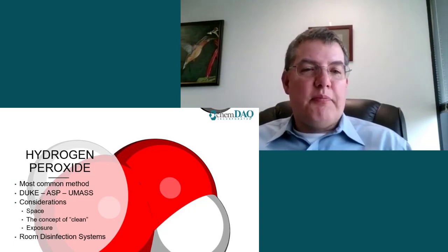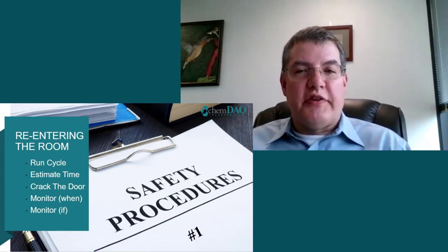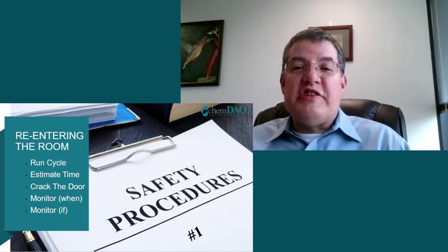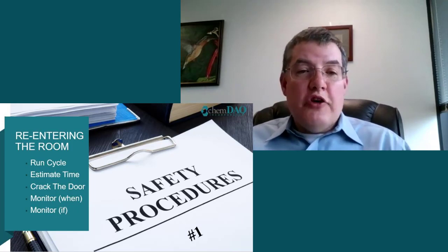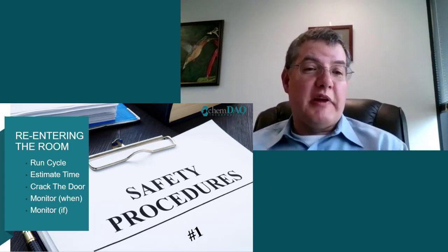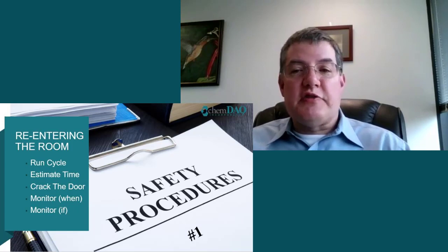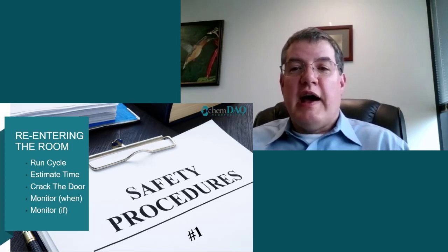With room disinfection, the big question is, how do people know when it is safe to go back into the room after the disinfection process is over? Hydrogen peroxide is colorless and has essentially no odor, and so smell cannot be used as an indicator of concentration. The OSHA permissible exposure limit is 1 ppm, so a very low concentration, as may be expected for something which is a commonly used sterilant gas. If operators do not wait long enough before re-entering, they risk being exposed to dangerous concentrations of hydrogen peroxide. And if they wait too long, then they will reduce the throughput of mass disinfection at a time when availability is critical.